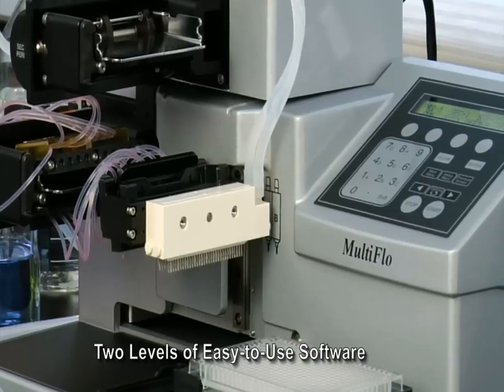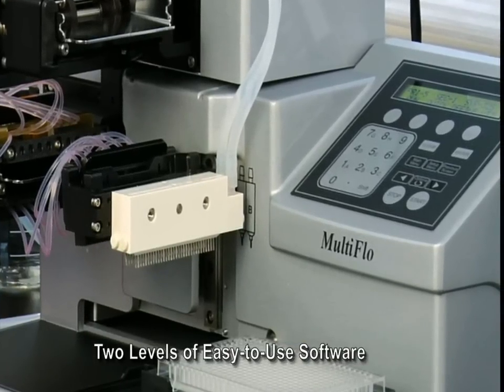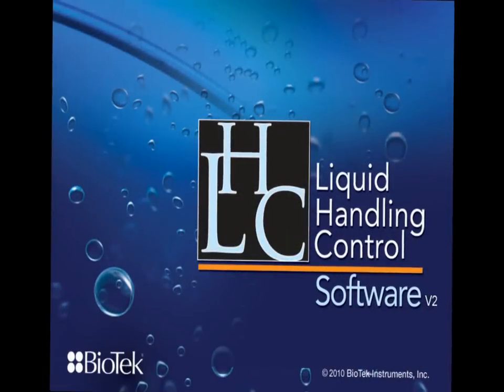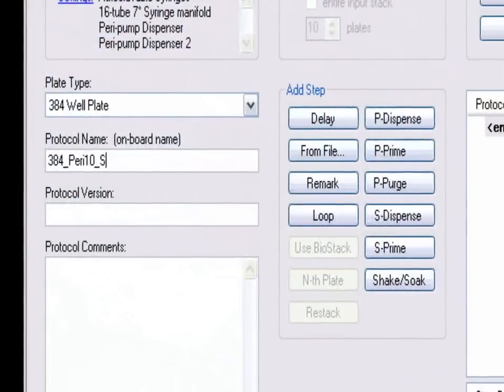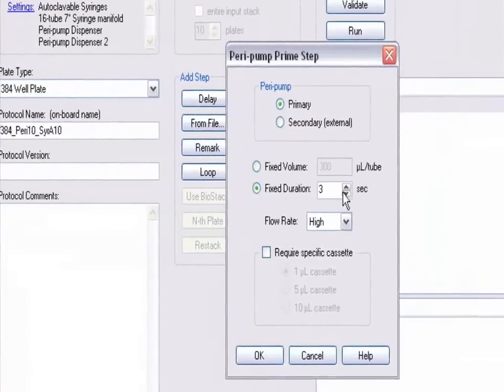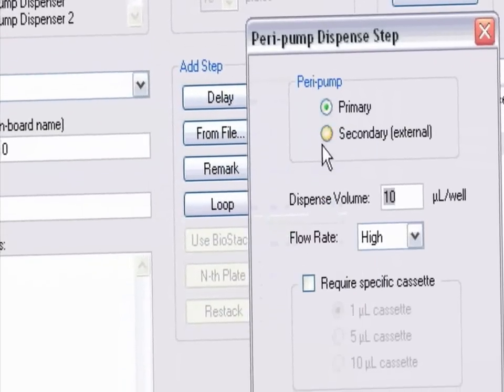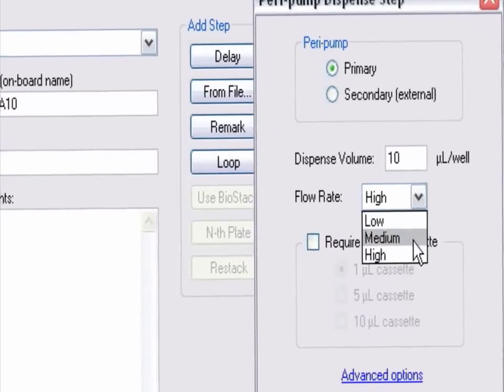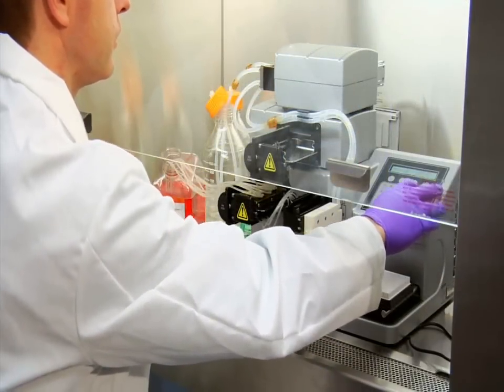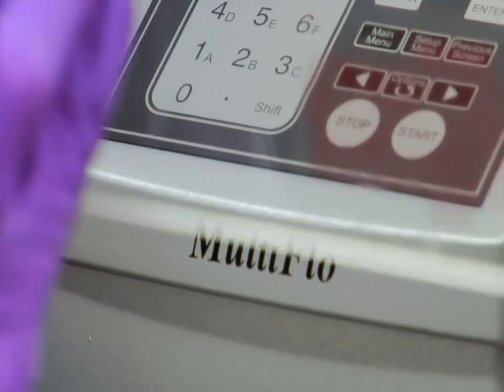Two levels of easy-to-use software give users a choice in dispense control. The Multi-Flow's keypad enables a quick dispense mode along with customizable protocols, while optional liquid handling control software expands the instrument capabilities with stepwise protocol creation, defined time validation, printed protocol reports, and full 21 CFR Part 11 compliance. LHC allows the user to create and run dispense protocols from the PC or download them to the instrument's keypad for installs such as within a biological safety cabinet when a computer is not readily available.